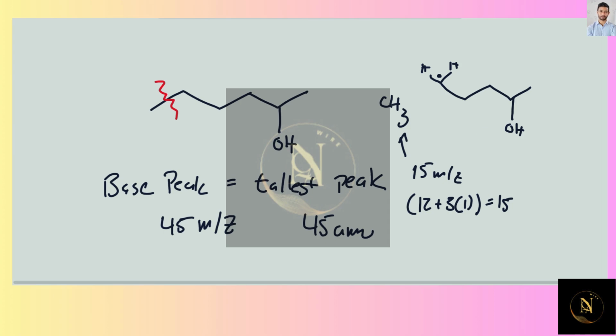And then this would be 102 minus 15, because this whole thing together weighs 102. So this would be 87.